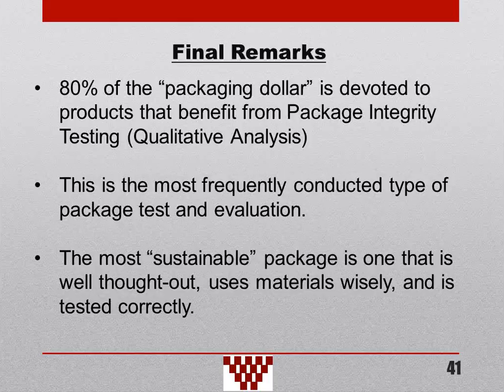Finally, I'd like to point out that about 80% of the packaging dollar, if I can use that term, is devoted to products that will benefit from this package integrity test procedure. In other words, about 80% of the packaging effort can be evaluated in a qualitative manner as opposed to a quantitative manner. Winds up being far bigger than any other kinds of the evaluation technique in the packaging testing area.